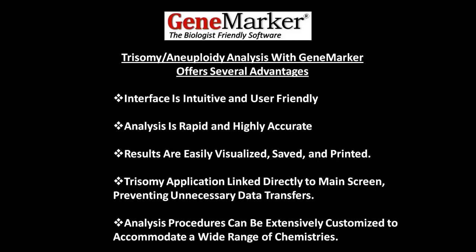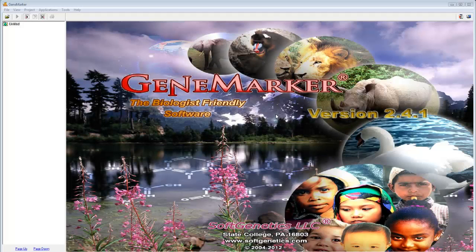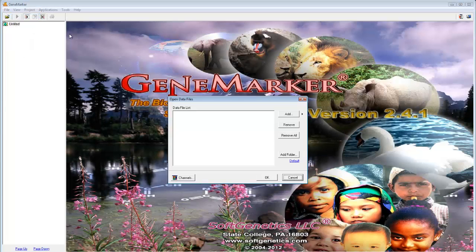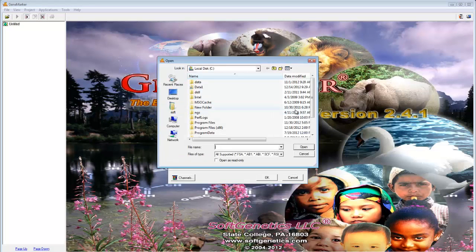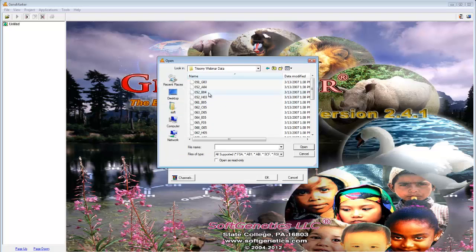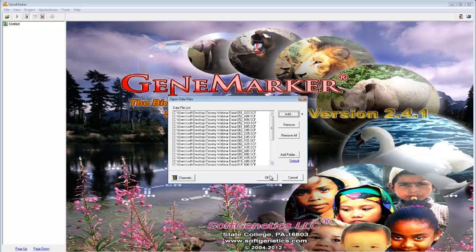Now, let's walk through a typical analysis procedure. To begin, simply load your traces by going to File, Open Data. Click Add and navigate to your traces. Then click Open and OK.